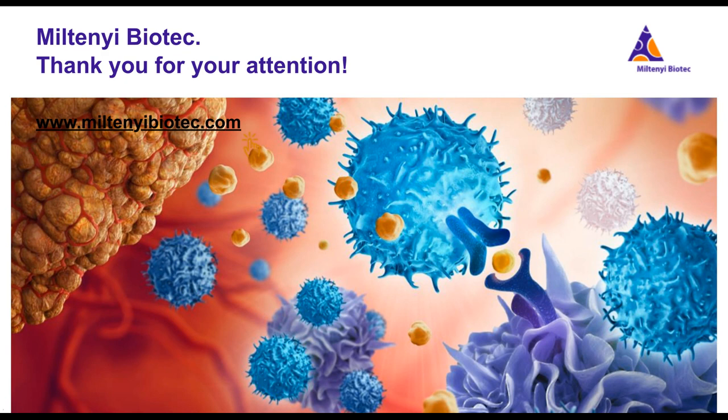Looks like we have time for one last question. How many samples can be analyzed using the SARS-CoV-2 T-cell analysis kits? The kits are optimized to perform 100 tests. However, for the analysis of one donor, we strongly recommend to always include a separate negative and positive control. So in total, this means you could analyze up to 33 donors and always have a positive and a negative control included.